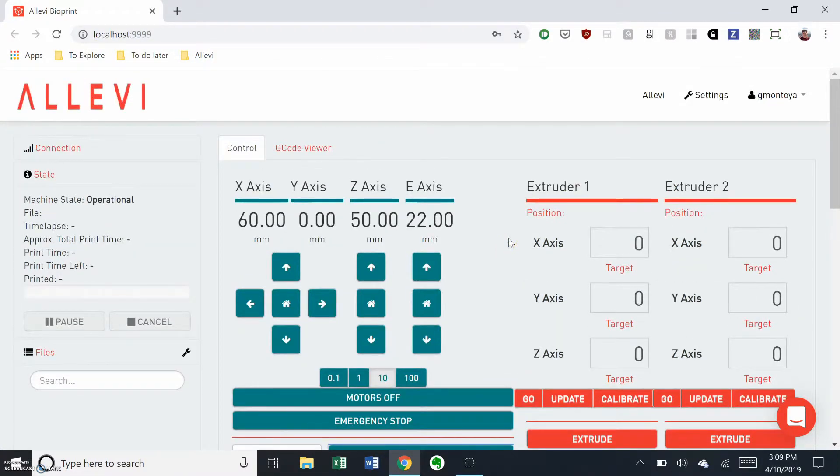With the step increment set to 10 mm, move up the z axis. This will bring the bed plate back up.